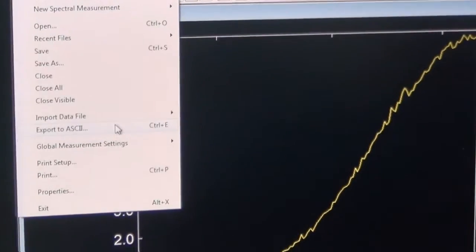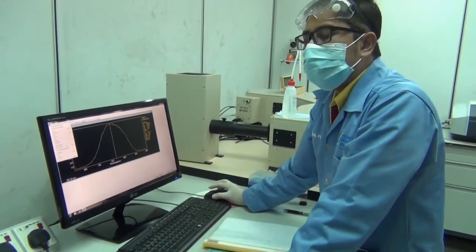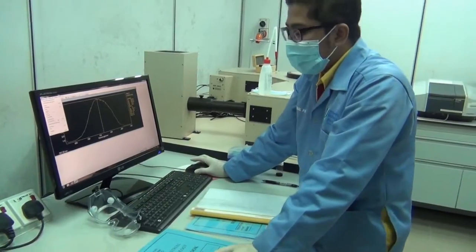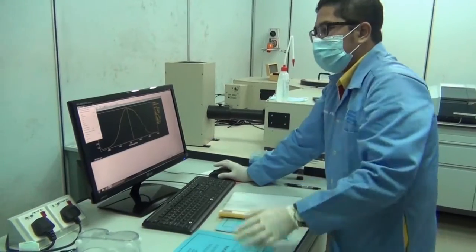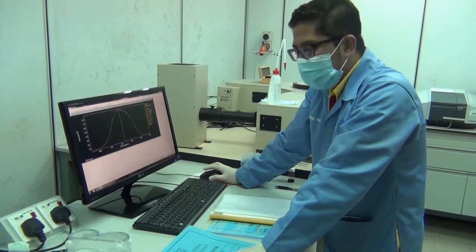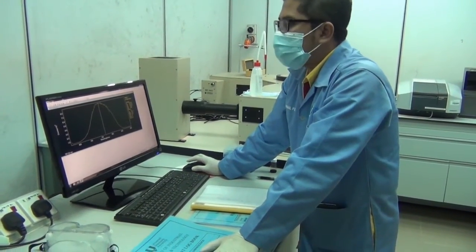Whenever you have opened it in Microsoft Excel, you need to replot the graph using different software. Extra marks will be given if you are using other software than Microsoft Excel. What are the software that you could use? One is Microcal Origin. You could use Microcal Origin to replot this graph instead of Microsoft Excel. If you are using Microsoft Excel, no extra marks will be given. But if you are using Microcal Origin, which you could download from the internet, or you could ask the software from me, extra marks will be given.